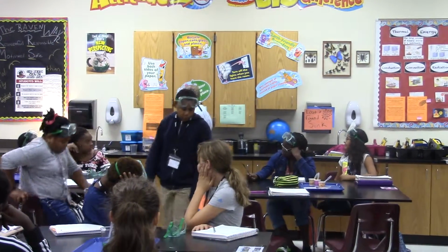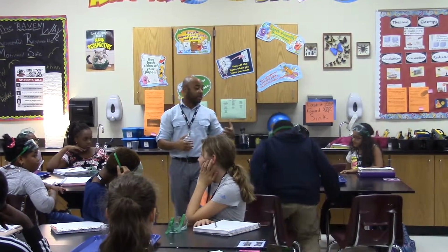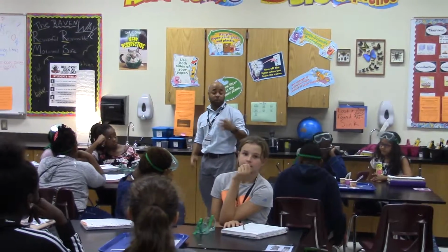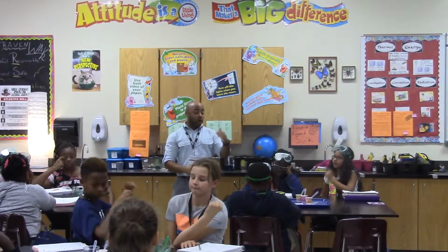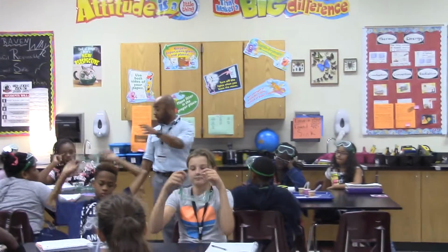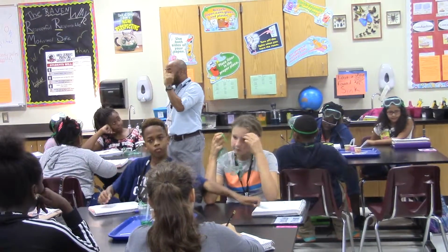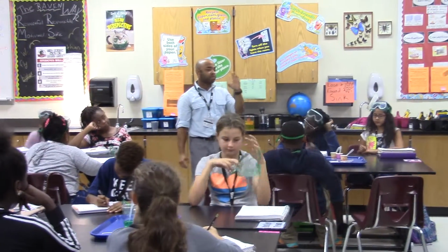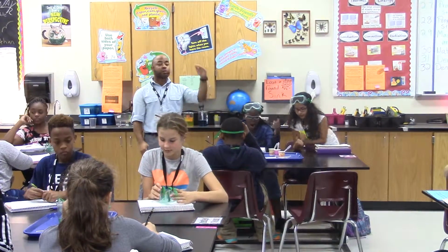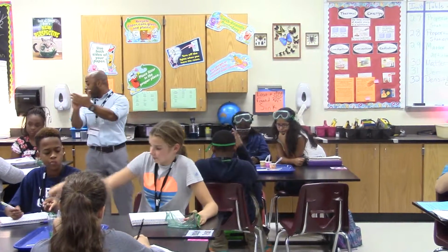So that's what we're going to be doing today. Instead of using solids, though, we're going to be using liquids. And on your table, the liquids that you have, that's what you're going to figure out which one is the most dense. So every one of you all have 3 things listed on your sheet and on your tray. I want you guys to make an estimated guess, make a prediction about those 3, which ones are going to be the most dense all the way down to the least dense. And write it in your chart.